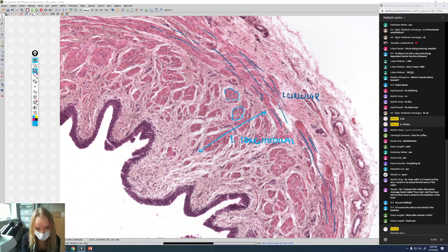And sometimes when you're going deeper down the ureter, almost close to the urinary bladder, this is the ureter, and it's going to the urinary bladder right here, and the second ureter.